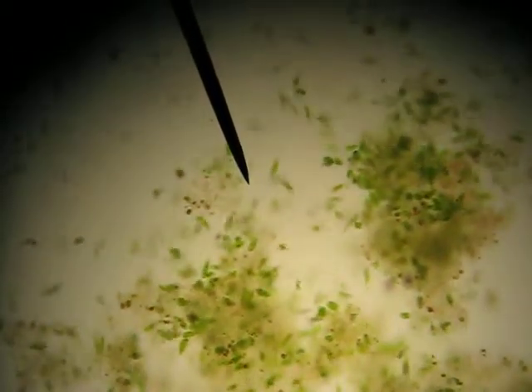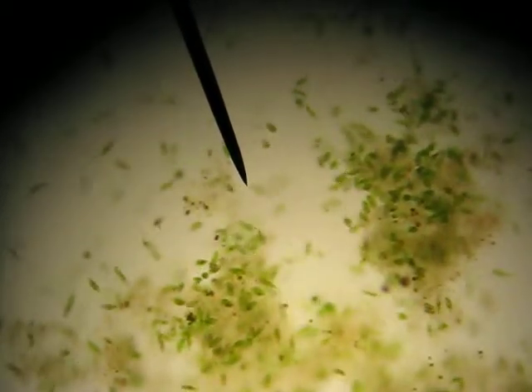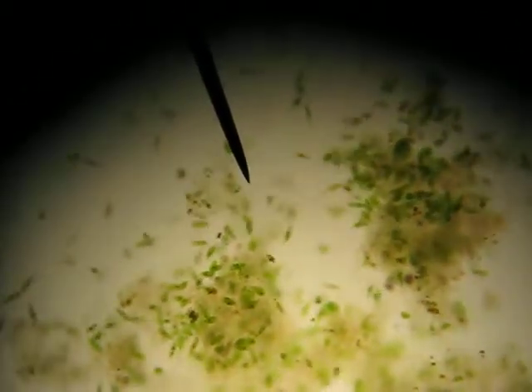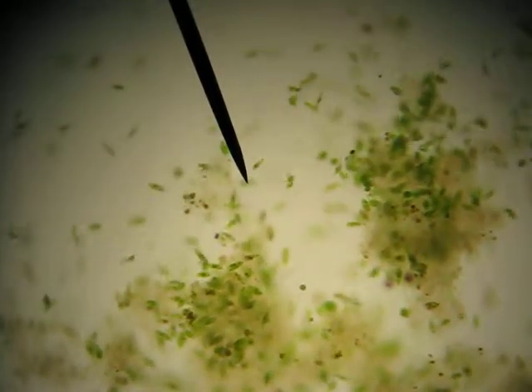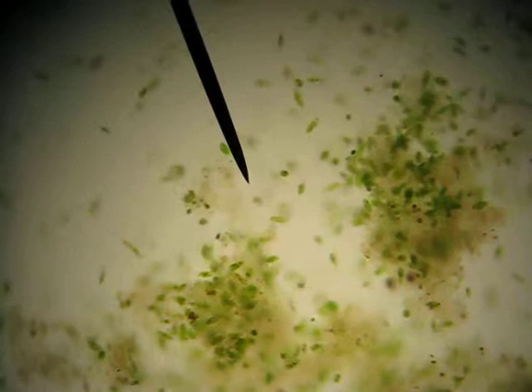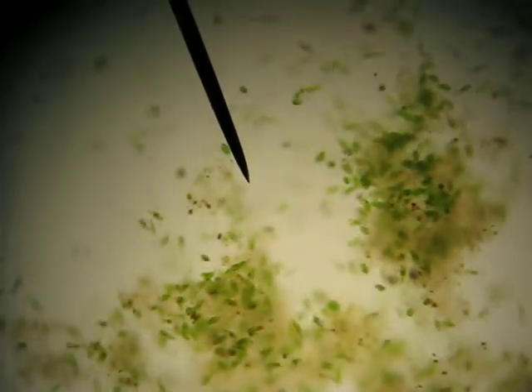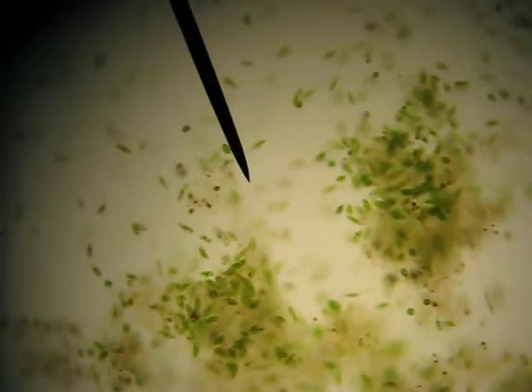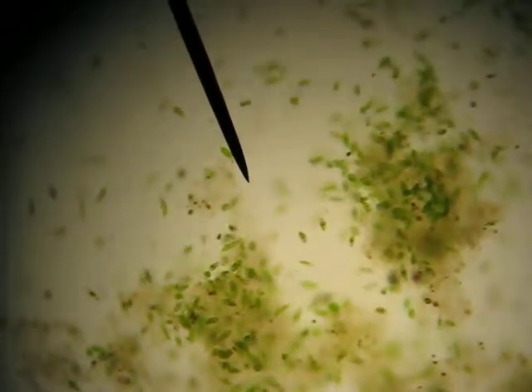So what he did was he took these algae inside, or these protists, and these guys are green, you can kind of see, because they have the ability to photosynthesize. They can use light energy. And these guys are swimming. The euglena is their name. Most of the green things that you see darting around swim by just one long hair-like appendage called a flagella.